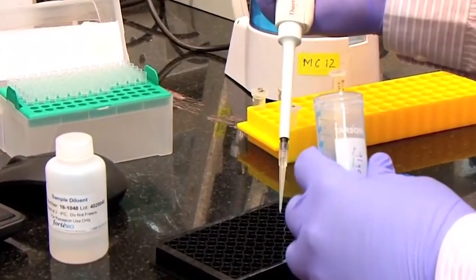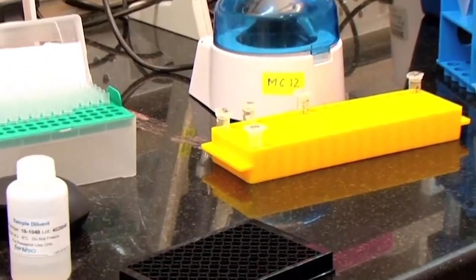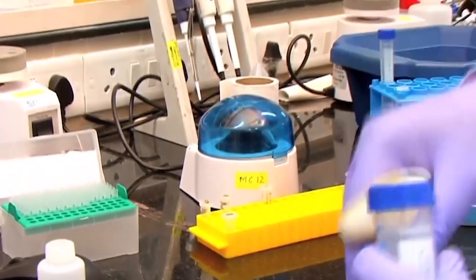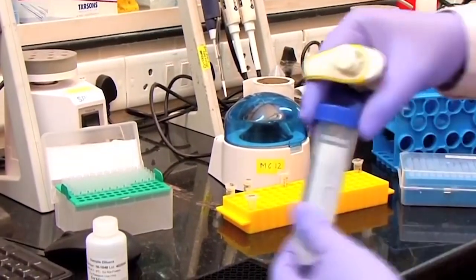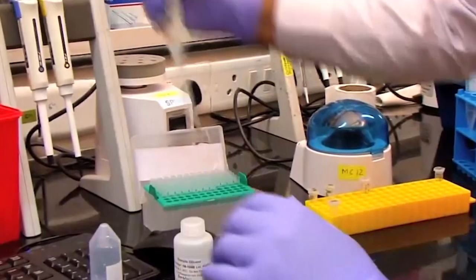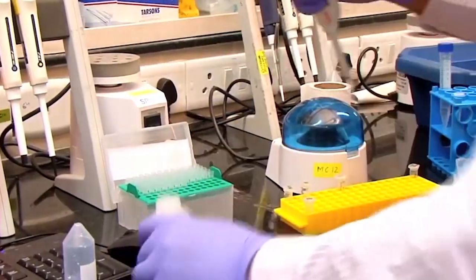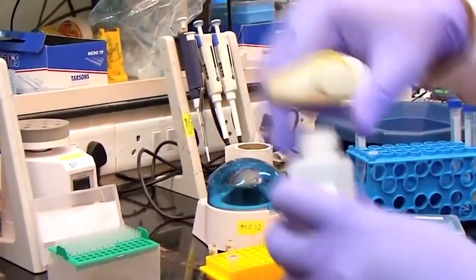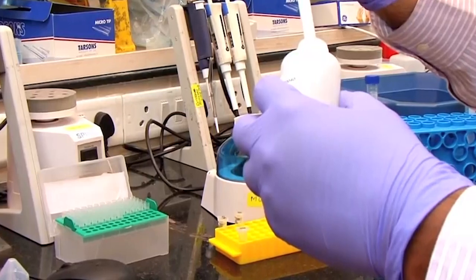So the bound apolipoprotein will be washed when the sensor dips into this acidic buffer. Also we have to place one more, which we call a neutral buffer. That is this PBST buffer. I'm going to place this one at the A12 and the B12.